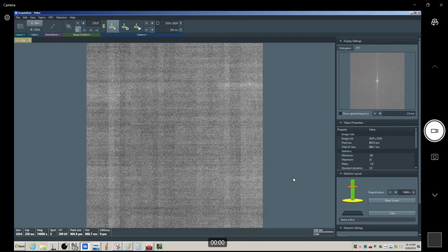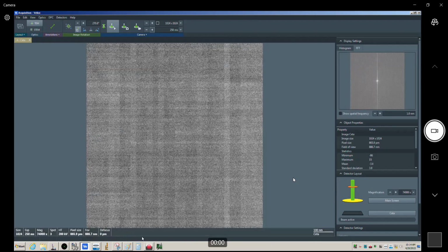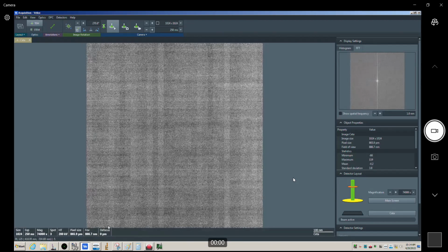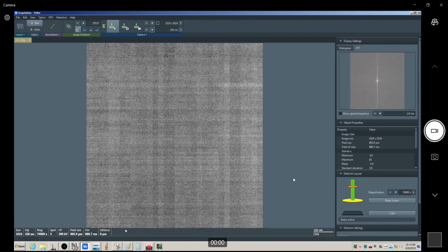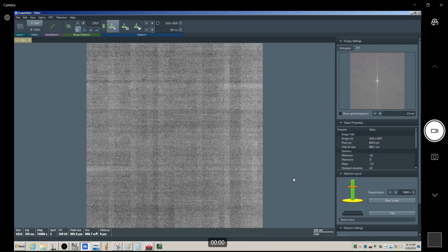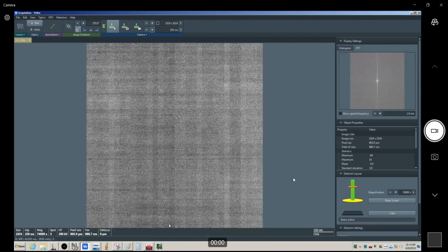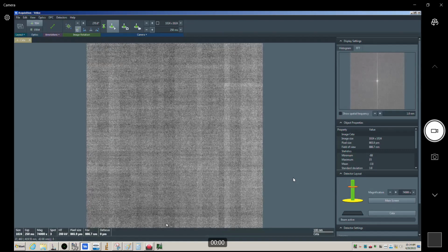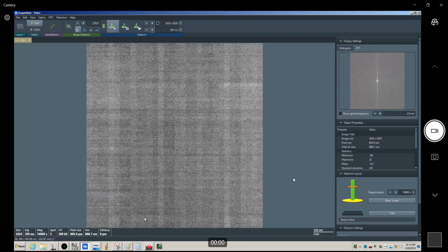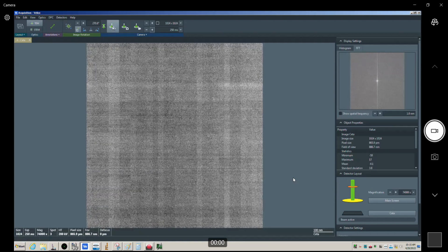The reason is you get a little more info with the data bar, and you no longer have the scale bar directly on the image. So it's very easy to just crop this out, because when you export this as a TIFF, you have this underneath it, and you can just crop it. If you want to draw in your own scale bar for a publication or whatnot, you can, but you also get this additional info that you didn't have before. Let me pause this for a second.